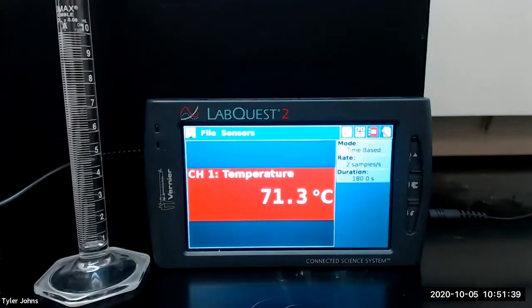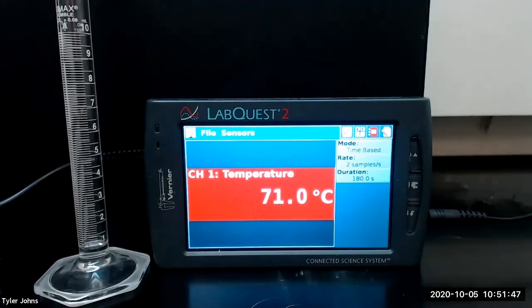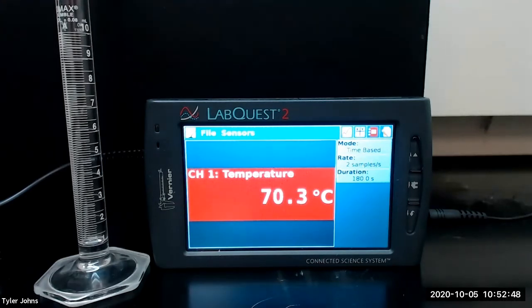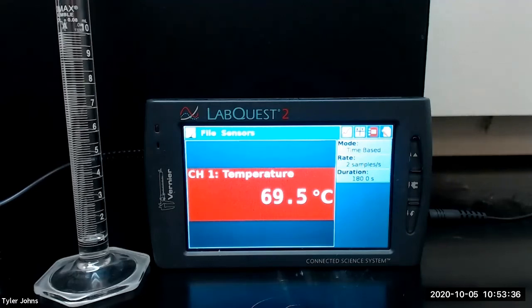We've now collected 0.5 milliliters of distillate, so we will begin recording the temperature every 0.5 milliliters. We've collected one milliliter of distillate, so we will now collect the next three to four drops of distillate in a GC vial.